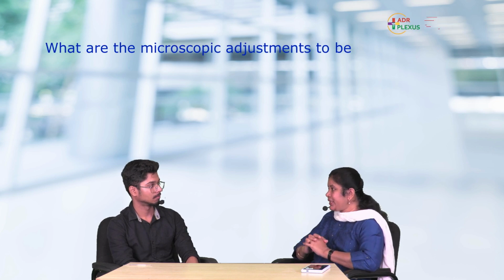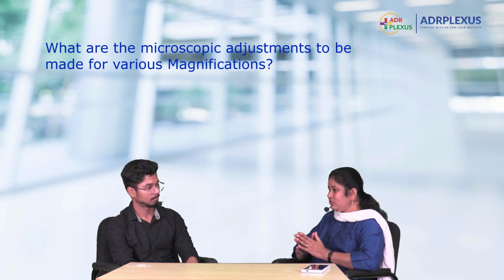Now, can you tell me the microscopic adjustments to be done for using each objective lens? How will the low power be focused? What adjustments will you make in the microscope? In the mirror, we use a concave mirror, ma'am, the condenser position should be at the lowest, and the diaphragm should be partially opened.